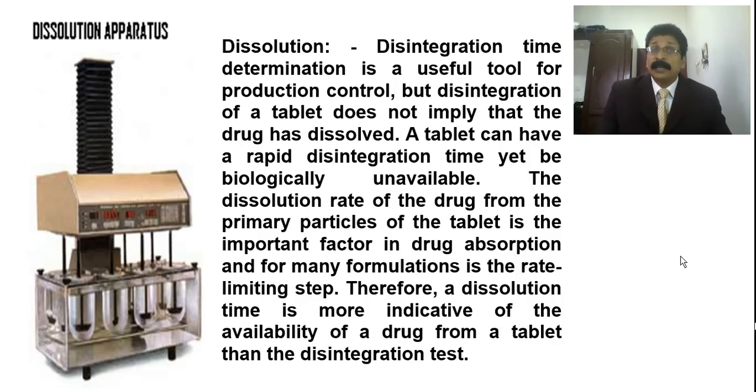Dissolution is finding out the release of the drug from the tablet formulation. So disintegration time, whatever I have told, is written in those points also. You can see disintegration time is a useful tool for production control, but disintegration of the tablet does not imply that the drug has dissolved.